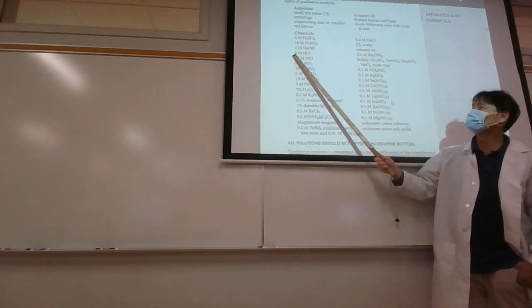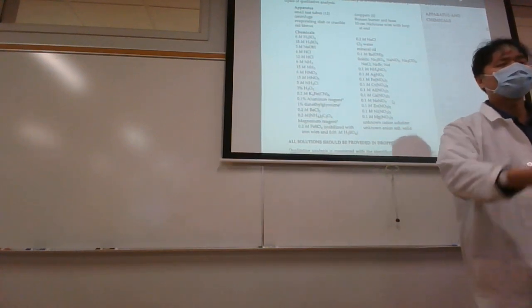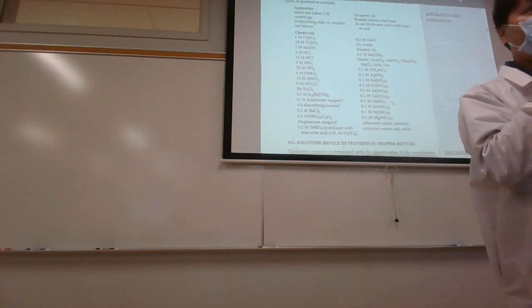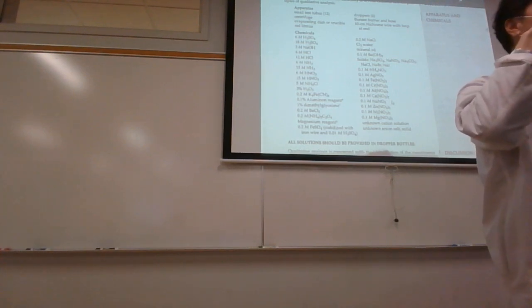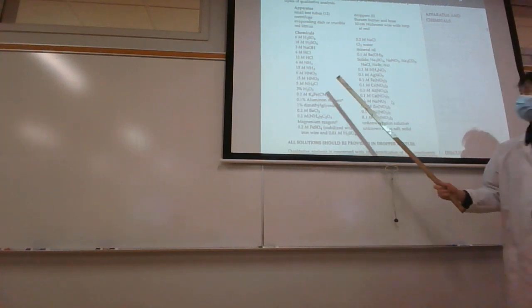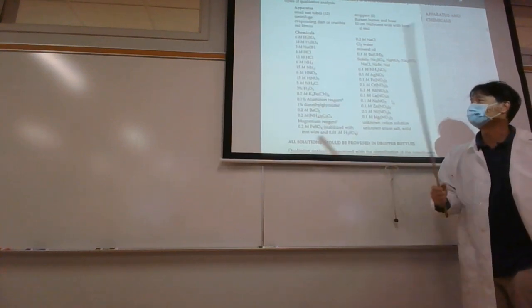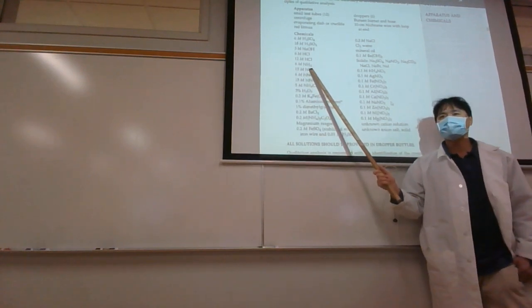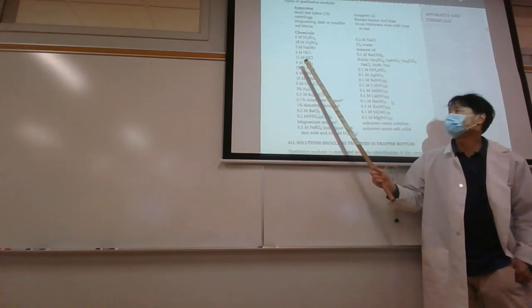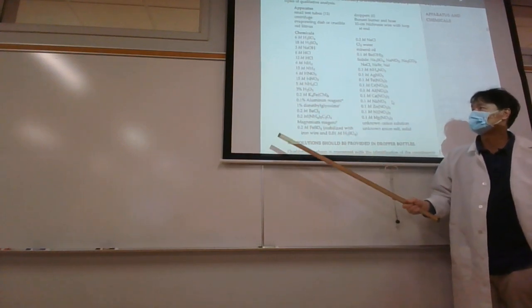HCl, we're using dilute and concentrated. Concentrated HCl is 12 molar. 12 molar gives off lots of fumes. It's fuming pretty much. And so if you put 12 molar under your nose, you're going to get a strong whiff of hydrogen chloride gas, which is going to cause a lot of irritation to your tissue. And so watch out for the 12 molar HCl. We usually do this in the hood. 6 molar ammonia. Dilute ammonia has a nasty odor to it. It's got that strong, powerful ammonia smell. But 15 molar is much stronger. You've already used 15 molar, but just be careful with that stuff.